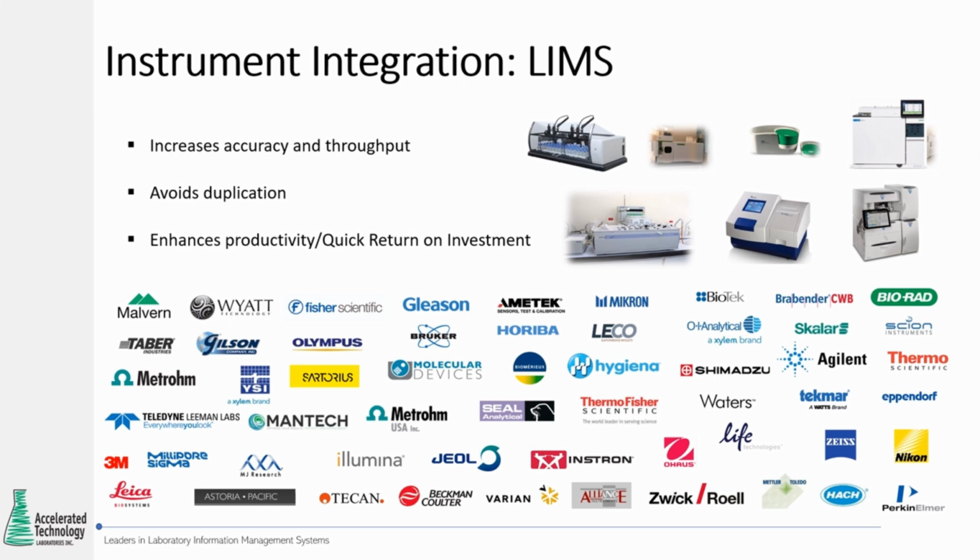And unfortunately, there's no standard. So each instrument puts their data out in a different format. So vendors are always capturing that format and creating a parser to put that format in a file that the LIMS system will recognize so that it can be automatically imported.